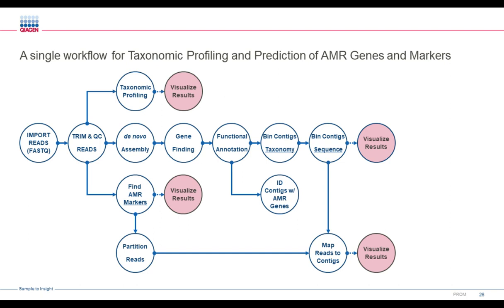So the nice thing is that all of these different capabilities and tools can be combined into a single workflow within CLC. And what you would do is build each of these workflows up separately, and then once you get them working, you combine them into a single large workflow to do a whole range of different analyses for you.